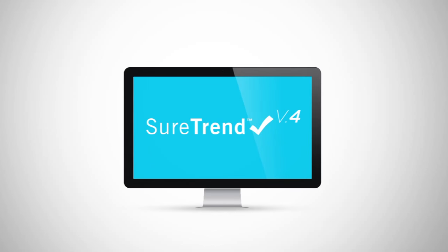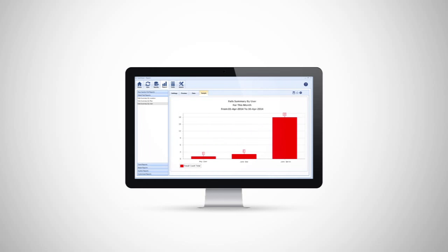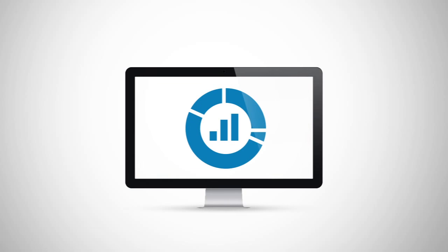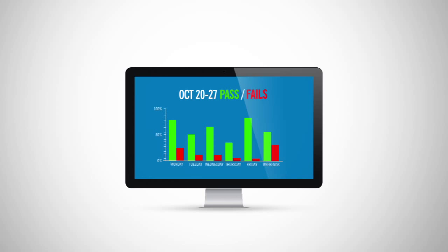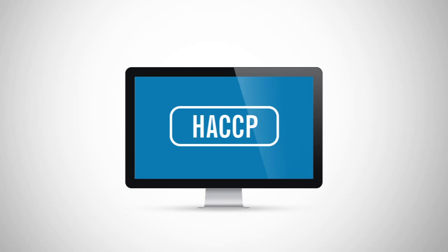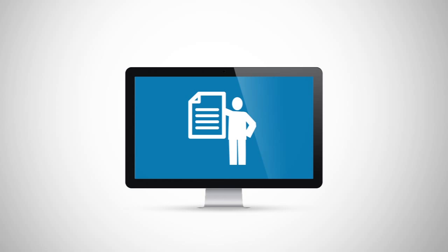To get the most out of your monitoring system, use Hygiena's complimentary SureTrend software to track and trend your test results. SureTrend software provides invaluable access to preset and customizable reports, making it easy to recognize trends and analyze sanitation effectiveness. SureTrend also assists in identifying environmental contamination, verifies sanitation as part of a HACCP program, and maintains records for audit compliance.